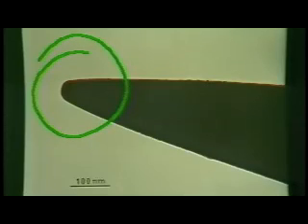But in fact, if one put these specimens into the goniometer stage of an electron microscope and looked in transmission, right, one would then see a highly magnified image of the end of this wire, which is opaque. And as you see, you can create these wires that have radii of curvature of about 500 to 1,000 angstroms or so.